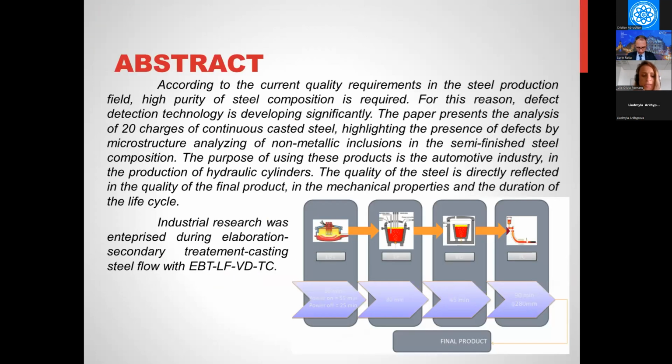The research presents a part of my PhD thesis regarding analysis of non-metallic inclusions in continuous casted steels, which purpose is to use it in manufacturing hydraulic cylinders in automotive industry. In this phase of the research, 20 charges of steel were analyzed. The steel was manufactured in an EBT LFVDTC continuous casted furnace.